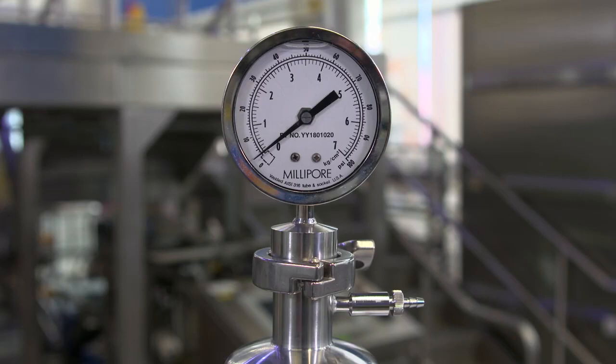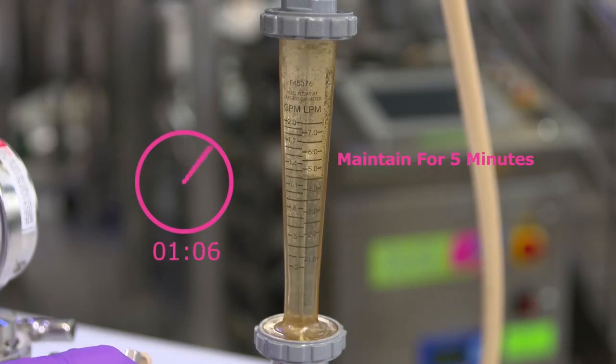For the typical 0.22 micron rated Duraport device, the differential pressure at one liter per minute per 0.1 square meters of filter area will be about 2 to 3 PSID or about 300 millibar. Maintain the flow rate for five minutes.